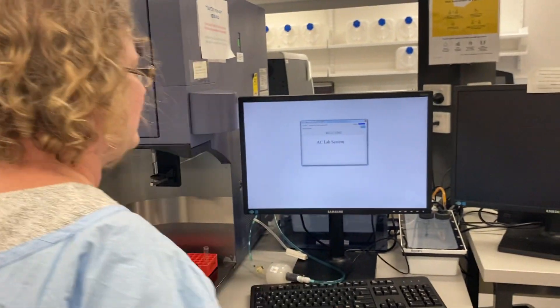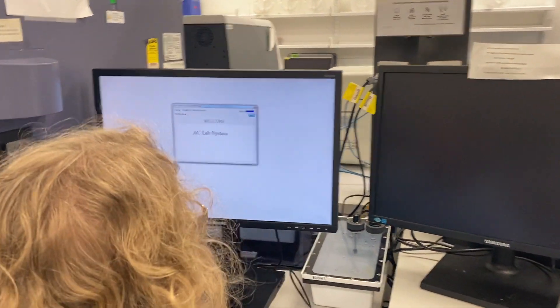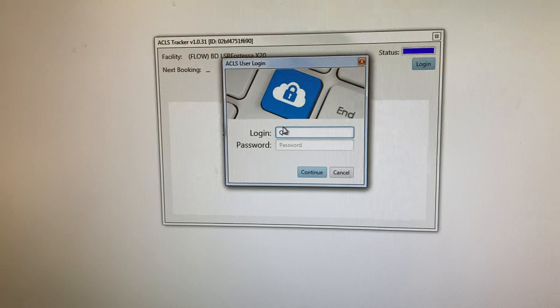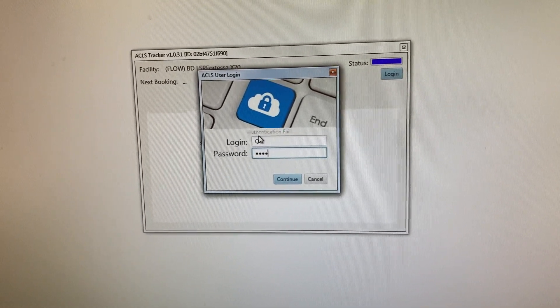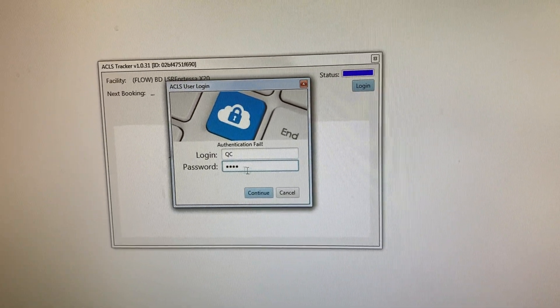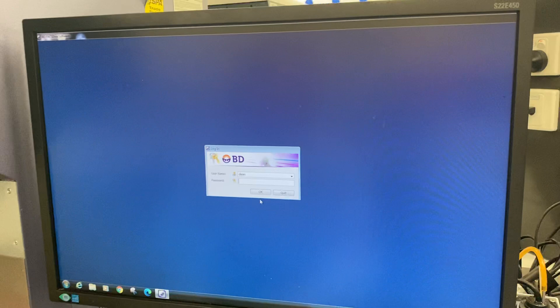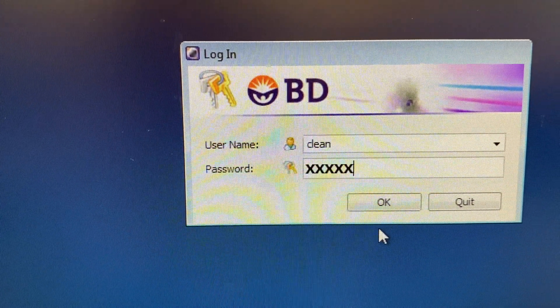Now let's log in. Log in to the ACLS system using 'QC' and 'Flow' with a big capital F at the beginning. FACSDiva is the software, and you log in via 'clean' — and the password is 'clean' as well.